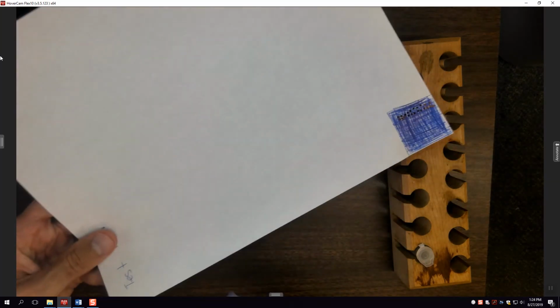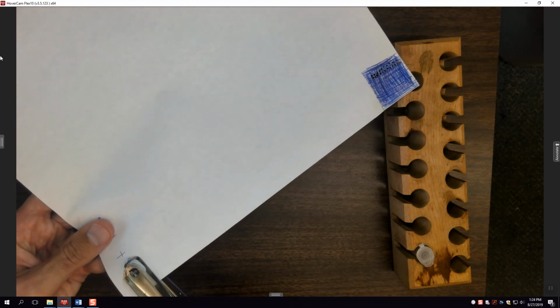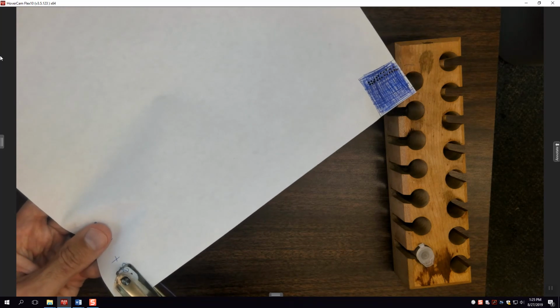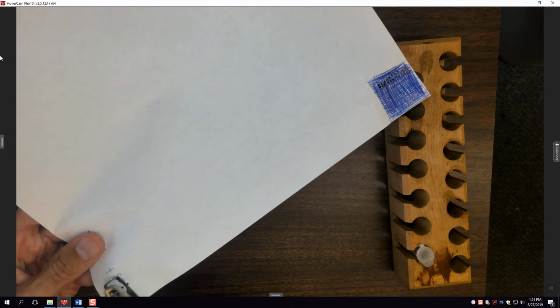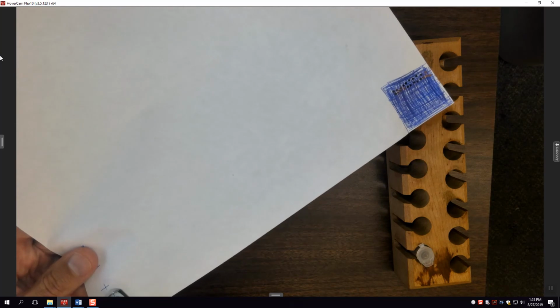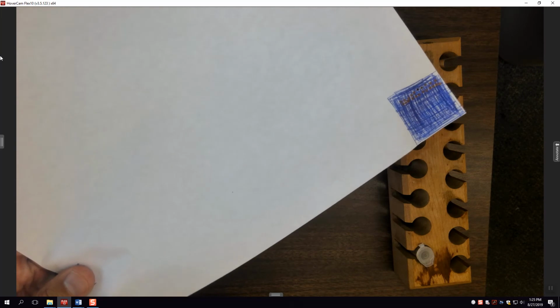Again, it can help to have this so that the punch part is on the top, and you basically look at it from the side and you can see exactly where it is, although that camera view is pretty nice, and try to get it over the letters as best you can. So you're punching out as much of the actual ink as possible. And you can just repeat for as much as you feel like you need.